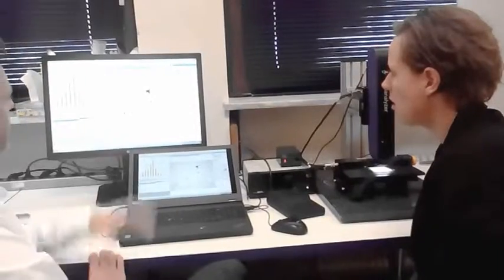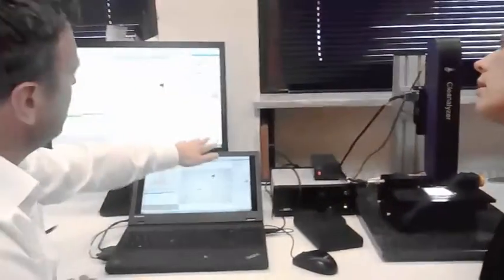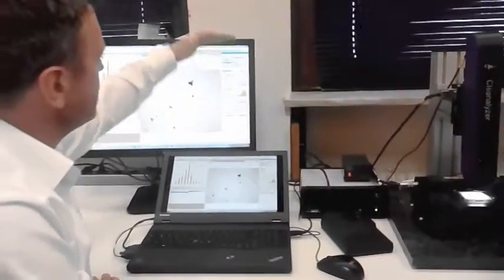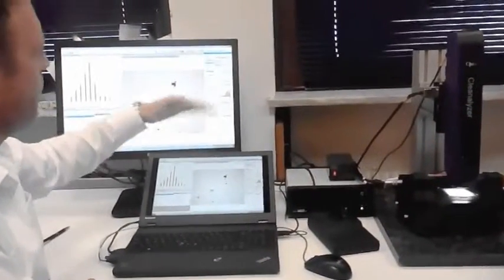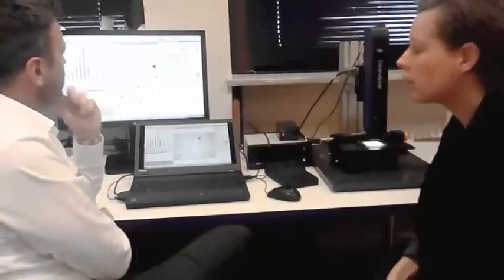Okay, so the software itself is quite useful, isn't it? Because we have this main control panel over on the right-hand side, and this seems to be in a chronological order of what to do next. We can work from the top to the bottom. Very good.